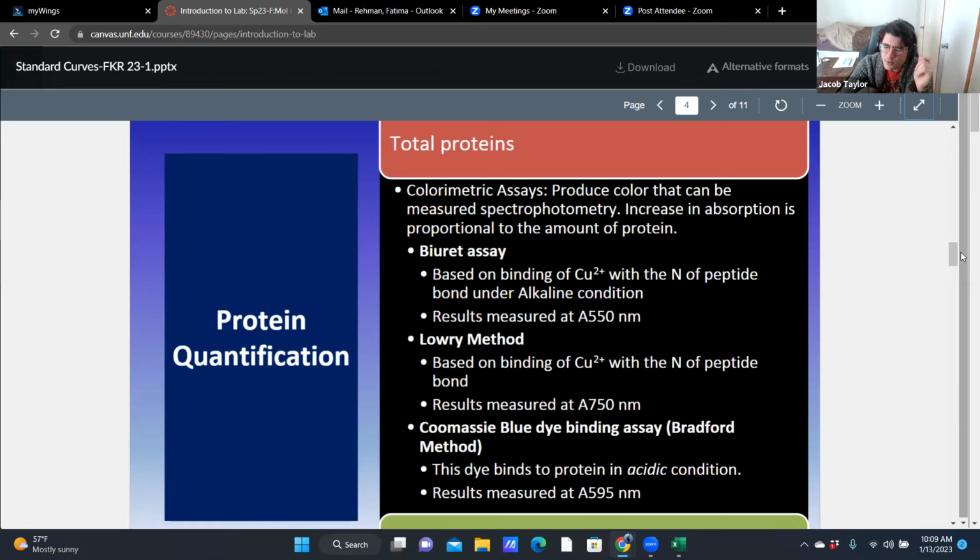It's in the 200s, right? It is in the 200s, you're right. I'm thinking like 280 or 295, one of those. 280, perfect. It is 280 nanometer.